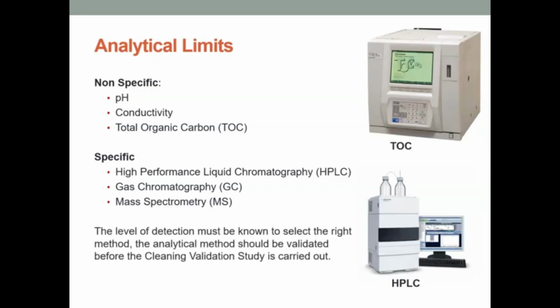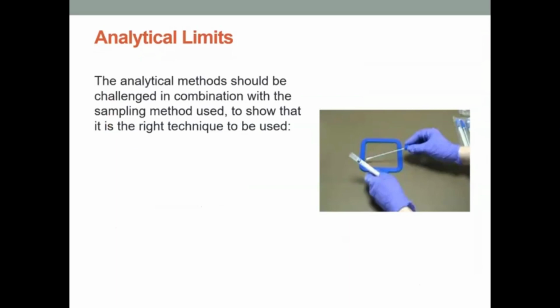The level of detection must be known so that you can select the right method. You need to know what your limits are and what your expected results should be. The analytical method has to be validated before the cleaning validation study can be carried out, so you need to have assurance that your method is working effectively prior to any cleaning validation.